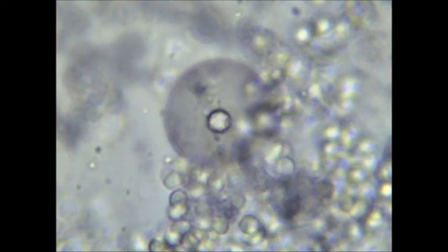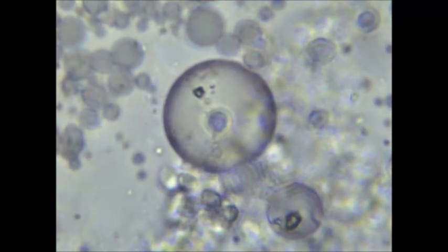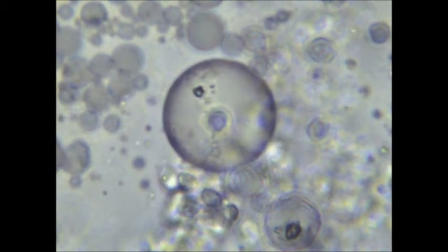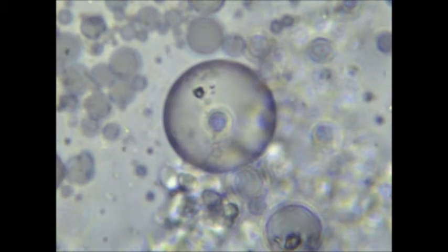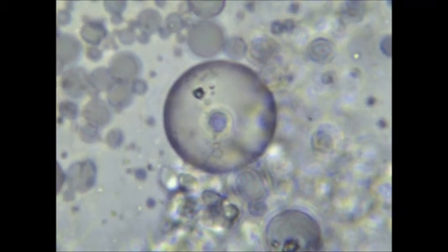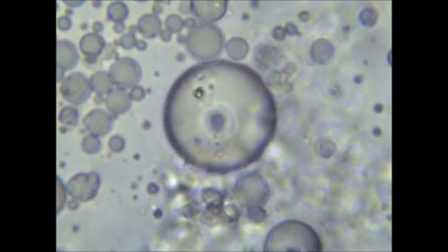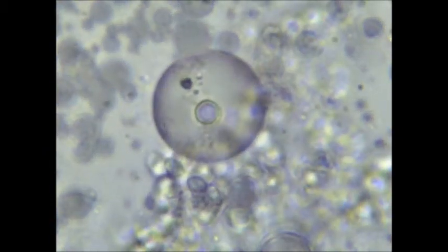I'm really not sure what it is that I'm looking at here, but I do believe that the smaller vesicle is in fact inside the larger one. If you watch the video, you can see me move the cover slip back and forth. Since this did not cause the two vesicles to separate, I am convinced that the smaller one is actually inside the larger one. Also, hematoxylin will stain RNA bluish purple, and indeed it does look like the smaller vesicle is purple.